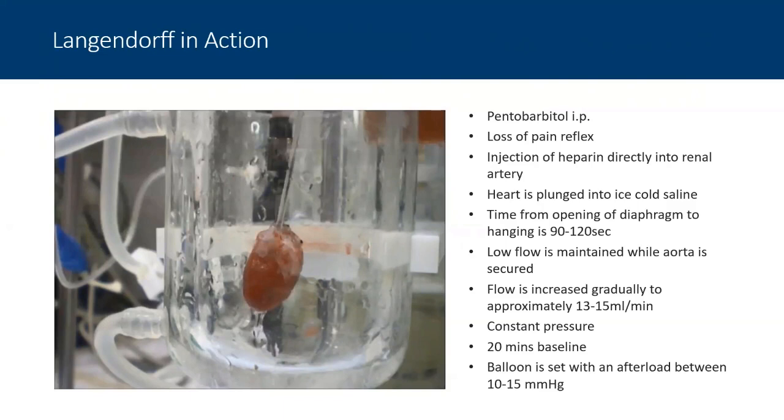This is important because as the heart relaxes on the Langendorff after going into some level of contracture, that diastolic pressure will actually decrease with time. And it should have established its bottom diastolic level within that baseline period. So it's another reason to use that baseline period.